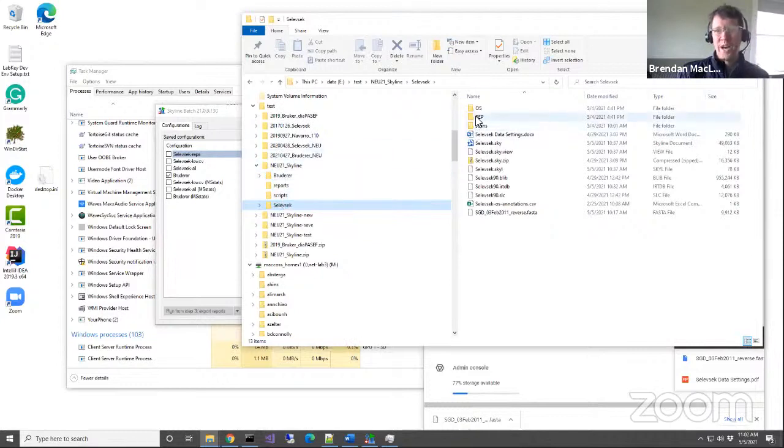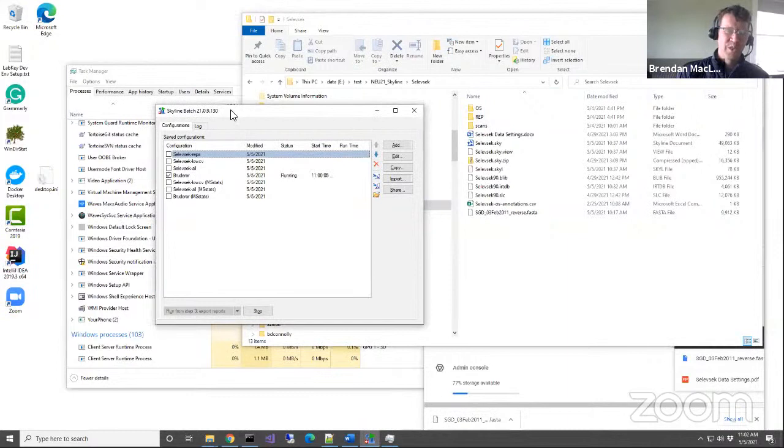We'll open up one for the reps, and we'll have three processed files for SelevSec, and we'll go over those results. But the challenge for you, if you're listening, is to actually get all those run yourself, so that you have this stuff sitting on your machine when we start talking about it.